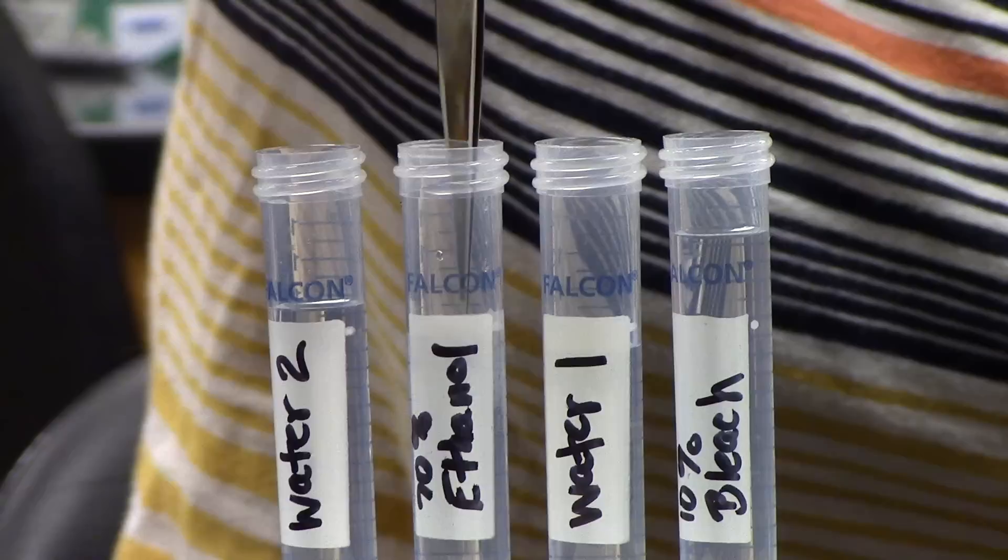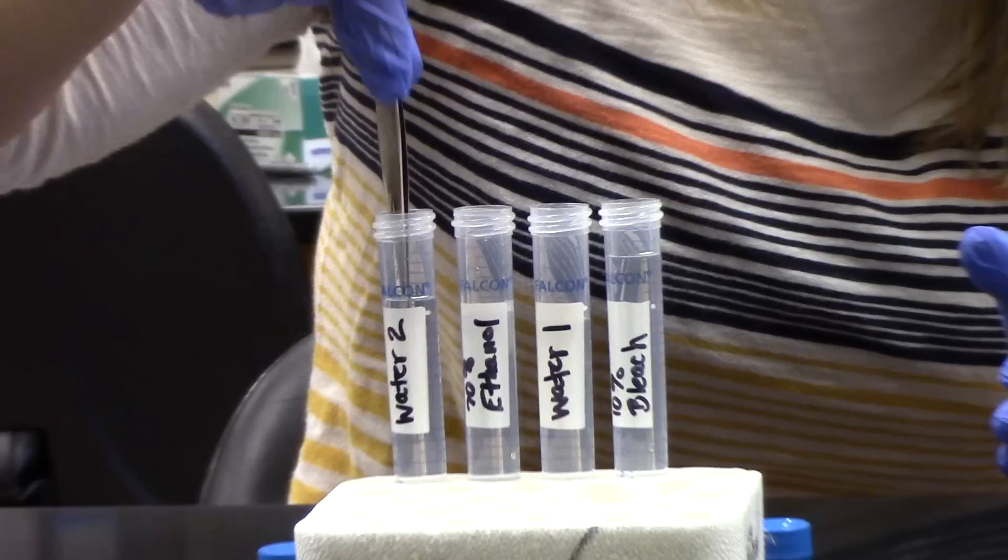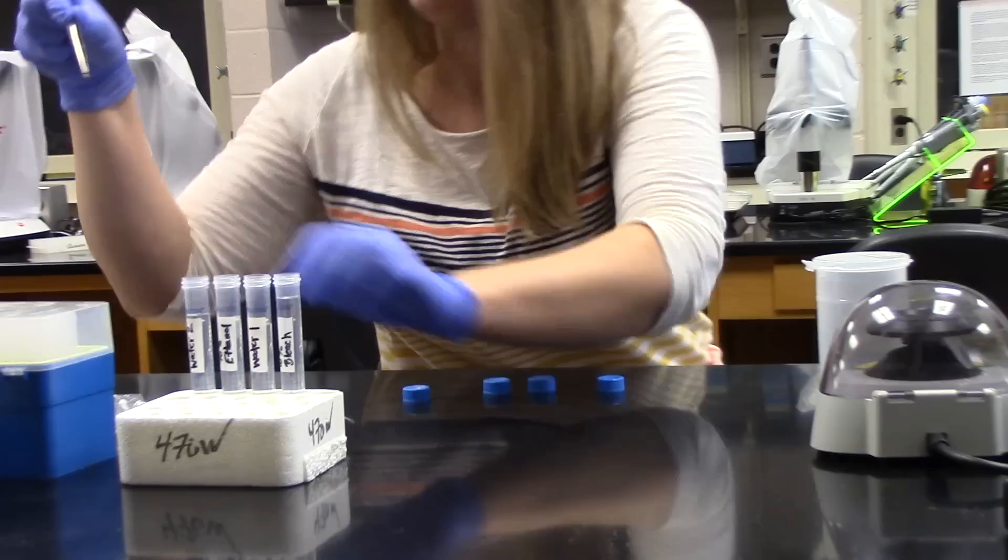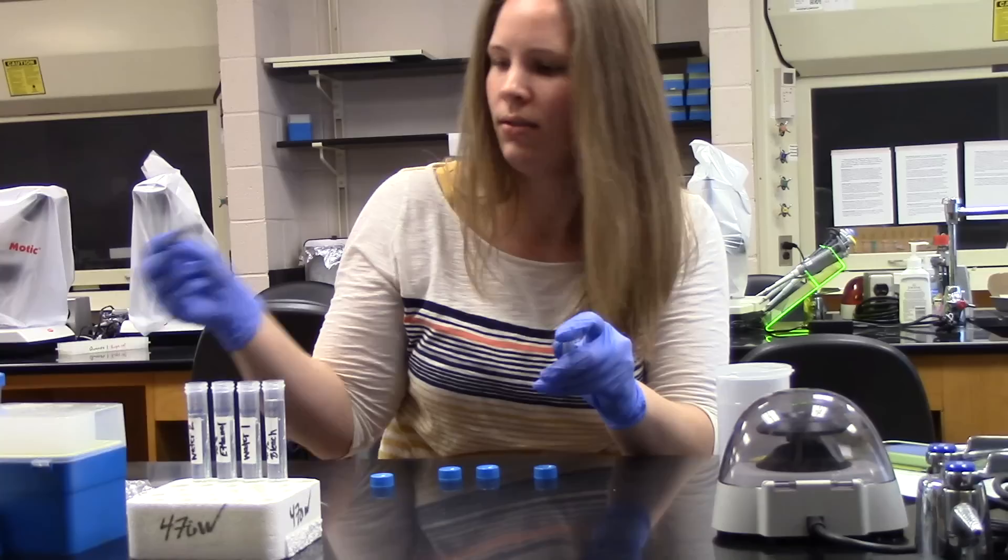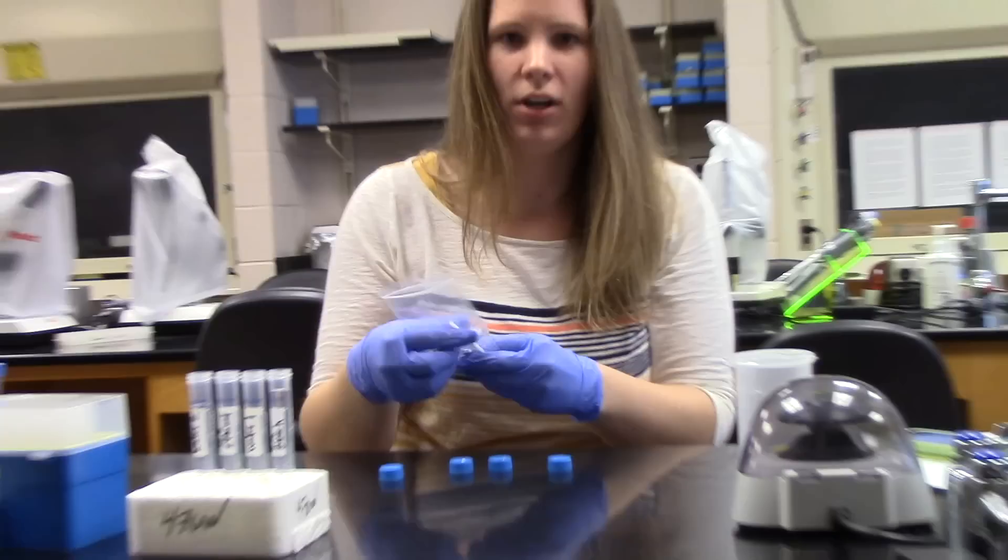Now our beetle is sterilized, and we can add it to the microcentrifuge tube containing saline. Now in the tube we want to crush the beetle. It's not necessary to pulverize the beetle completely.